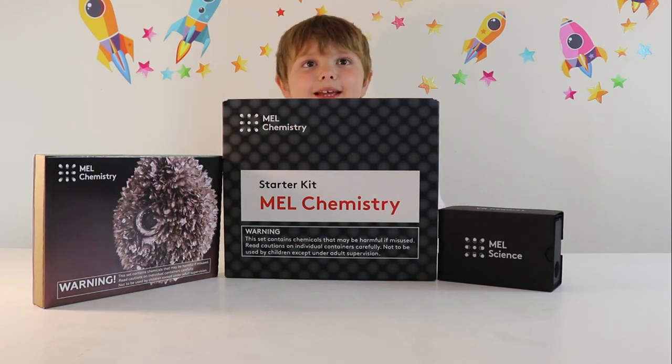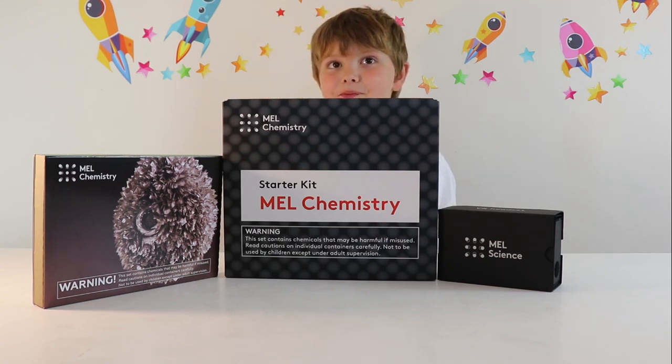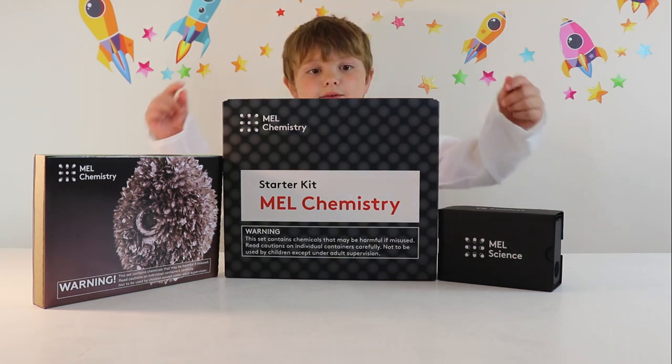Yeah, so we were really lucky — we got sent the Mel Chemistry Starter Kit, alongside a Mel Chemistry tin experiment to do as well. Let's put everything aside and then open up the starter kit and see what we get.